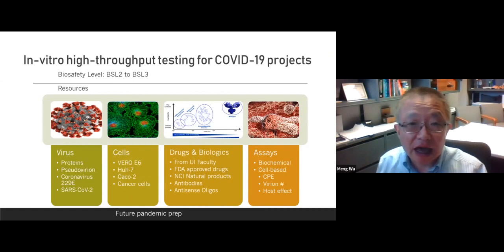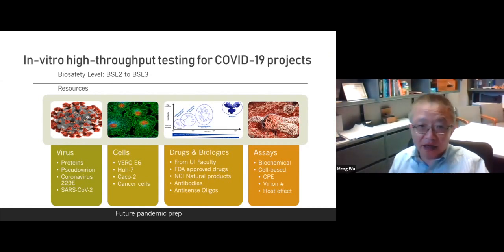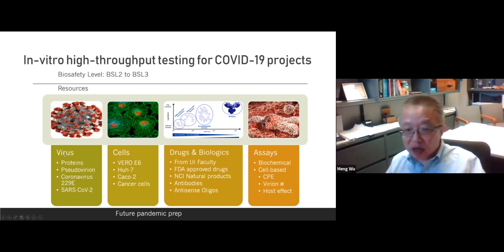There's an elephant in the room nowadays, COVID-19. When research ramped down because of COVID-19, we started to work on whether we can do something for this. Within a 2 month time frame, we built up resources for testing COVID-19, shown here. We're starting to work with virus.